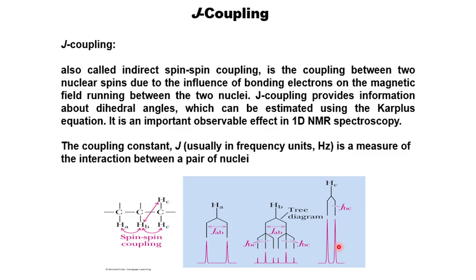That means the higher the radio frequency, the deeper you can probe, and you can get very fine information about the structure, whether there are some interactions or not. Now, is the coupling clear, or why you are getting a doublet or triplet or singlet?